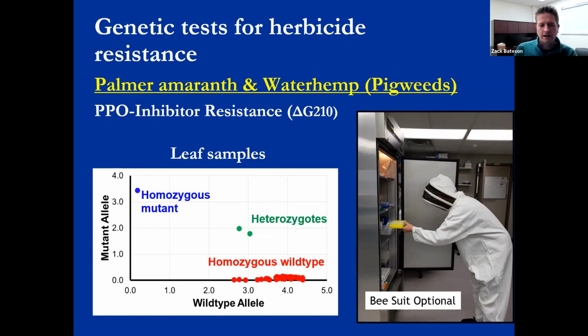And so this is just a quick output showing you the output of the piece of equipment that allows us to genotype. And in our archive samples that were collected in North Dakota, collected in Minnesota, we're finding these resistant or mutant genotypes in the populations. Generally, there's a lot more that are the wild type, but we are finding indication of these herbicide resistant plant populations in some of the species that we've already tested for.